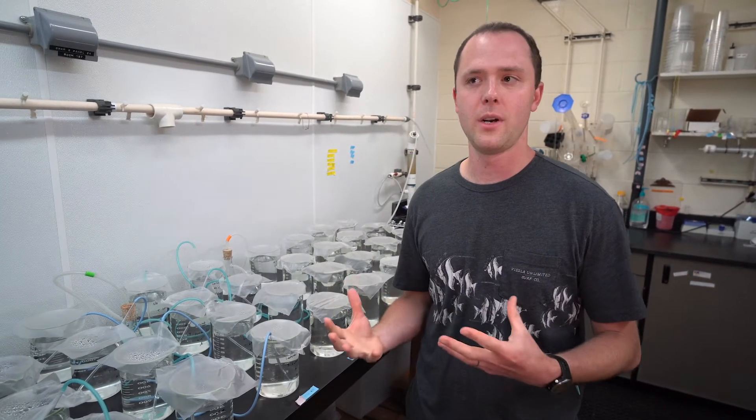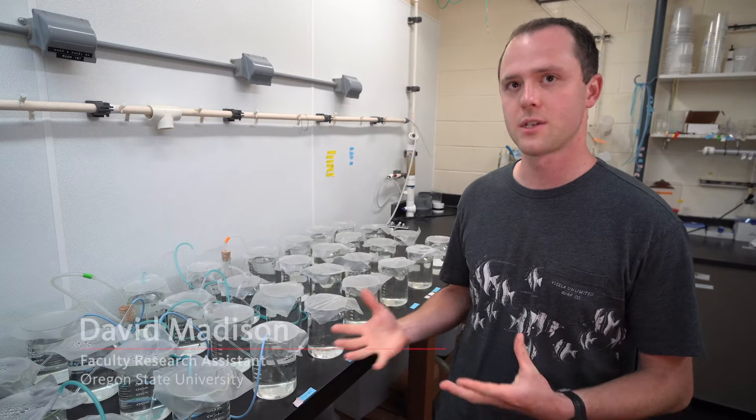So here at Hatfield we have the opportunity to have a lot of different larval culture systems that can be tailored to whatever experiment we're trying to do.